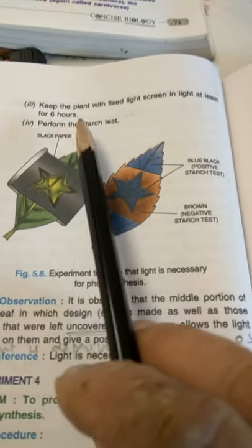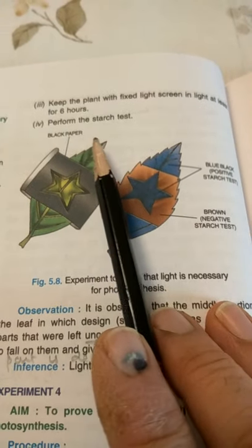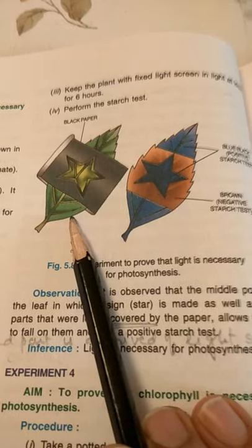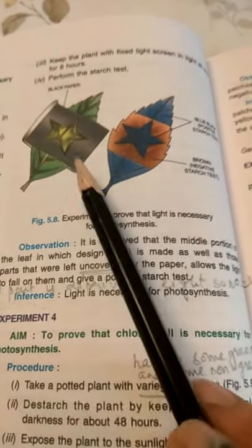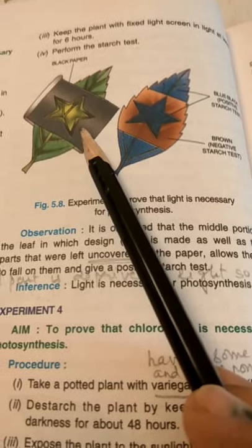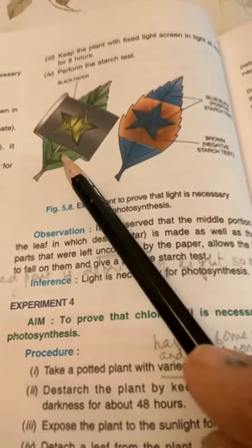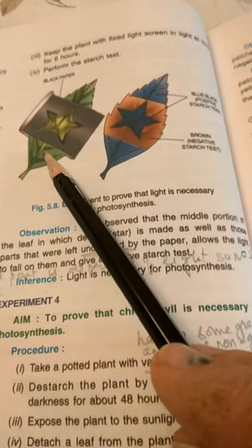We will keep the plant in sunlight for at least six hours. After that we will pluck the leaf which was covered with black paper and perform a starch test on it. We'll observe that the middle portion of the leaf where the star-shaped design was made, as well as the parts left uncovered, allow light to fall on them.